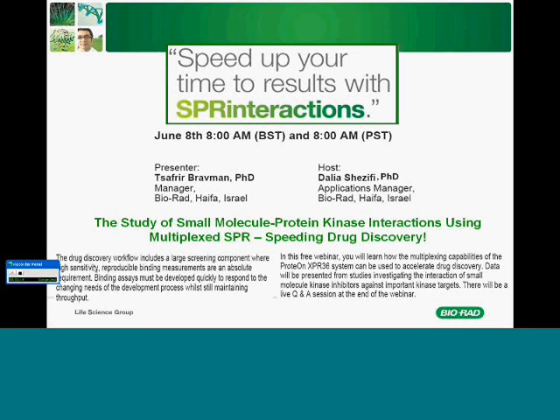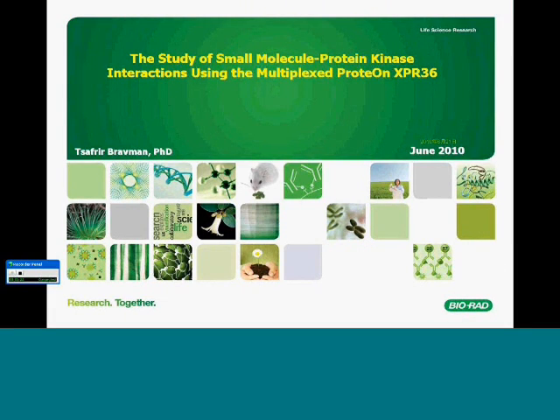Thank you, Dalia, very much. So as Dalia mentioned, I will be giving a talk today in this webinar about the study of small molecules, or kinase inhibitors, binding to different kinases using the ProteOn XPR36 of Bio-Rad.